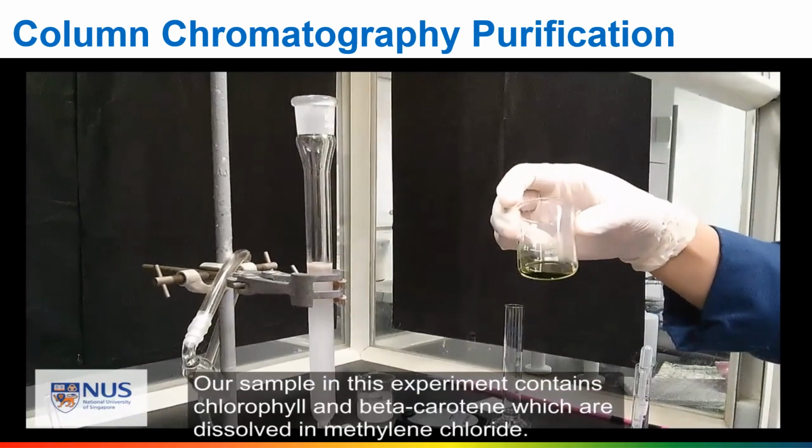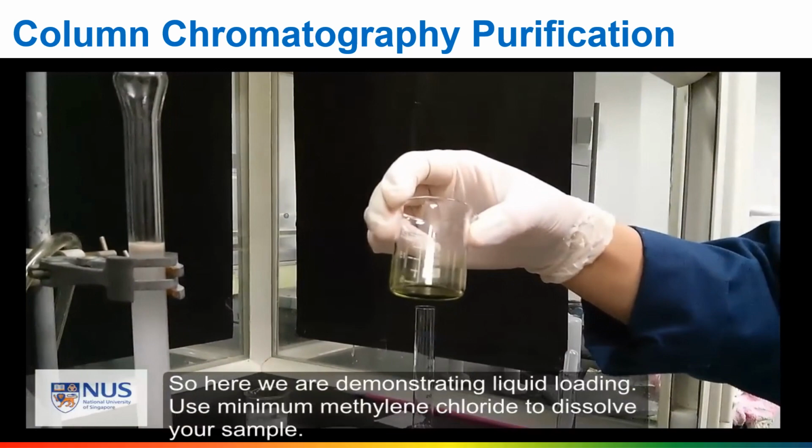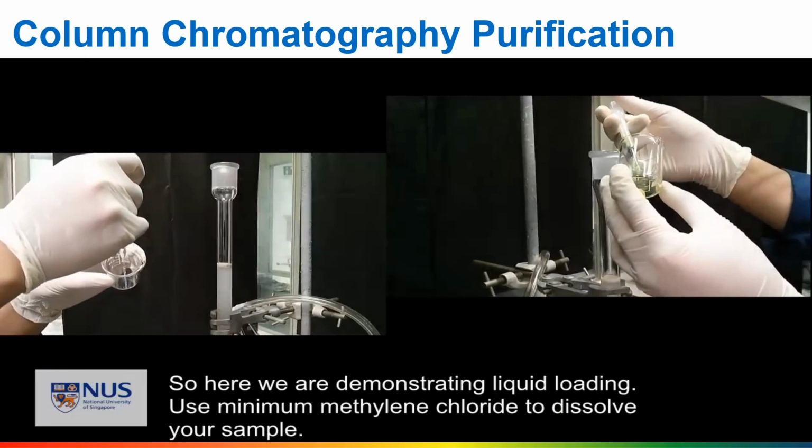Our sample in this experiment contains chlorophyll and beta carotene, which are dissolved in methylene chloride. So here we are demonstrating liquid loading. Use minimum methylene chloride to dissolve your sample. Use a dropper to transfer the sample into the column.